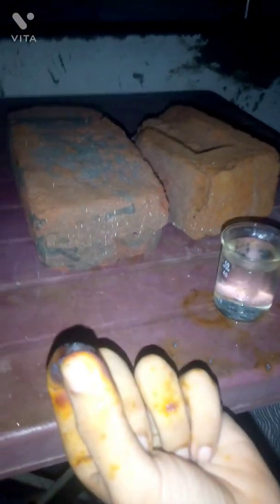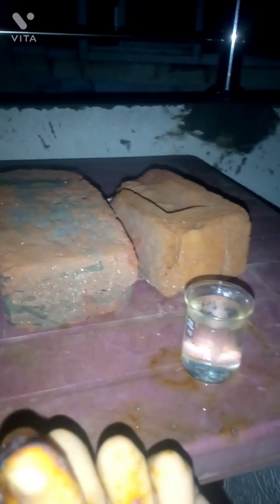This is a powder I put in my hand. It is a totally shiny powder, the crystals of iodine. Never touch it like this. So you can see it is a very fine glossy powder. This is a property of iodine. When you heat iodine, it evaporates, and if you condense that iodine, it looks something like this, a very fine and very shiny powder.